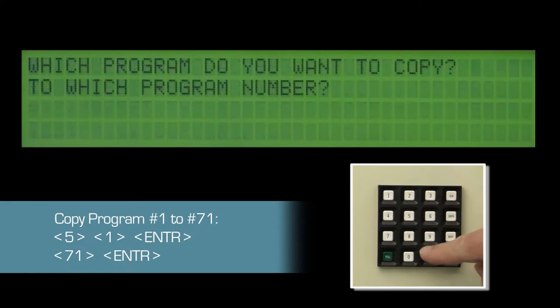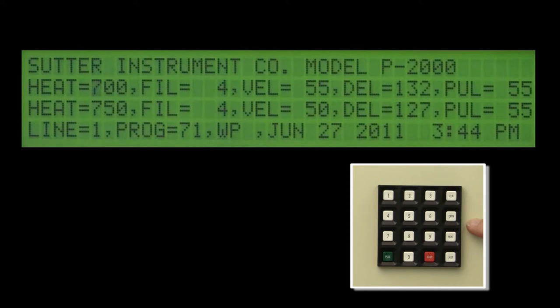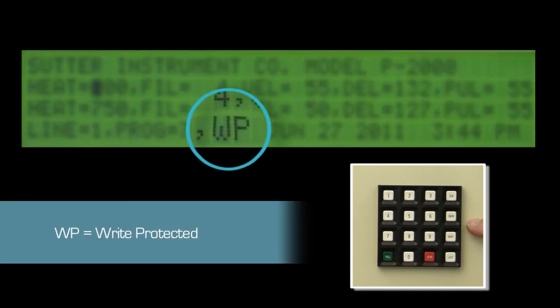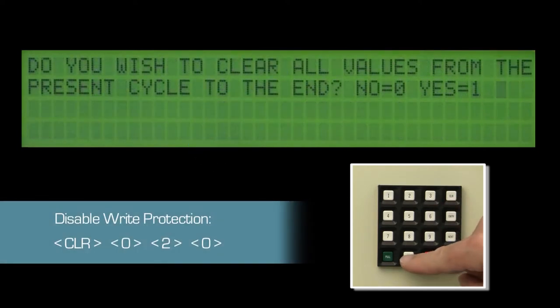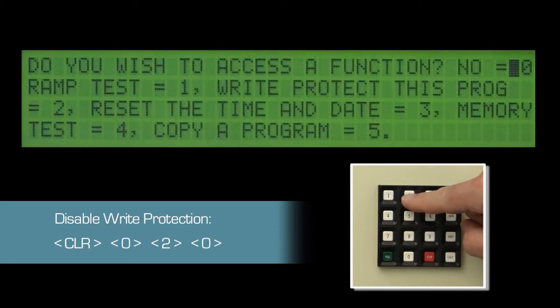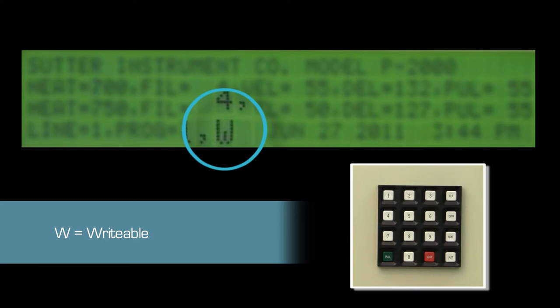Then press 5 for copy. The program we want to copy is number 1, and we want to copy it to program 71 since we know there is nothing important there on our demo puller. The new program is automatically selected. The write protection in program 1 was copied along with the pull parameters. Since we are planning to make changes, we access the software control functions again with clear 0, then press 2 for the write protection menu and 0 to turn write protection off.